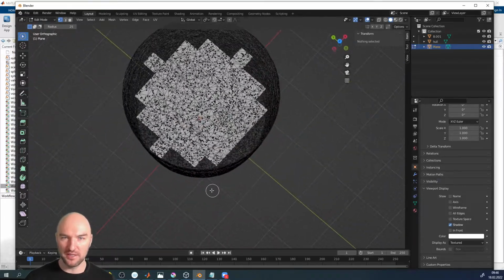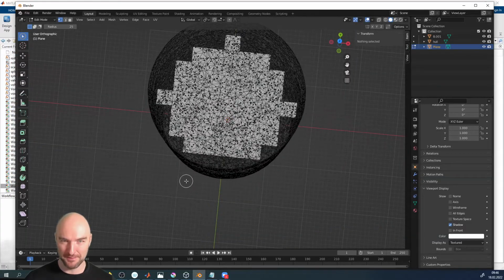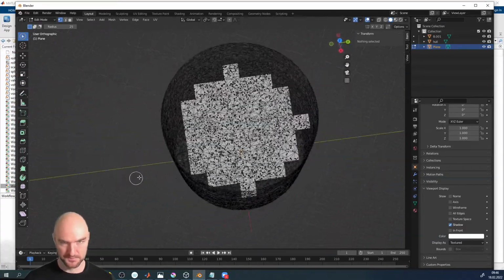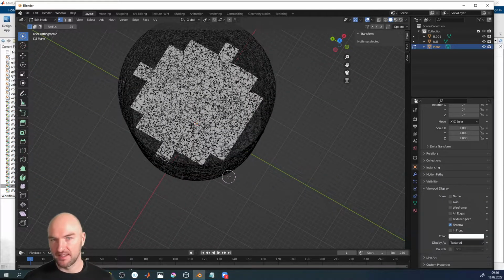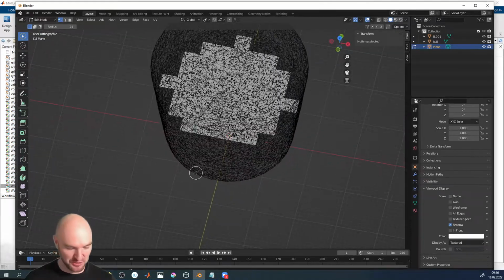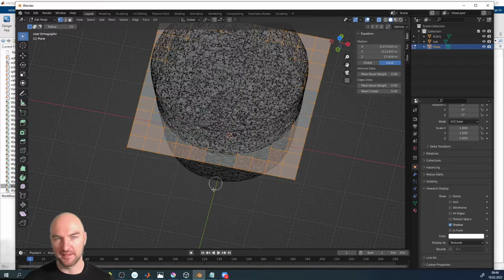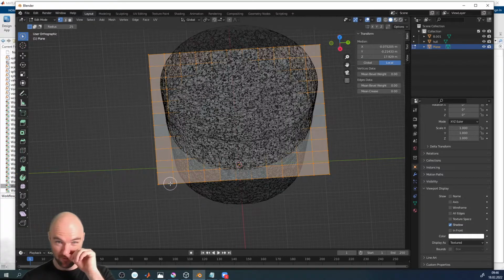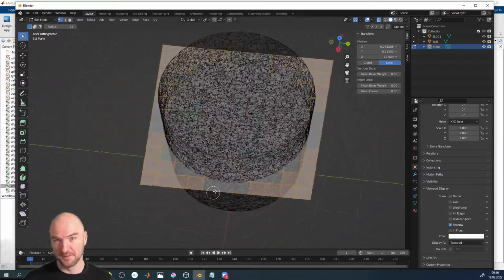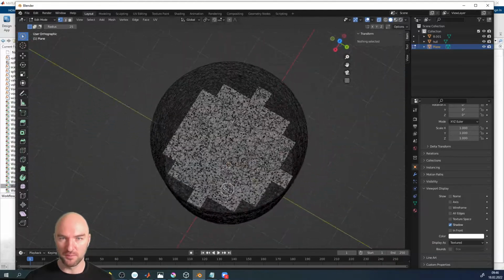And now we've only got the vertices left that are inside. Maybe some of those that were barely outside we might have kept. But yeah, I think this is just a basic introduction to modeling. You can see that you might have made a finer mesh. With a finer mesh, it might have worked a little bit better. But this is now our initial starting point, and we are going to go and improve upon that.